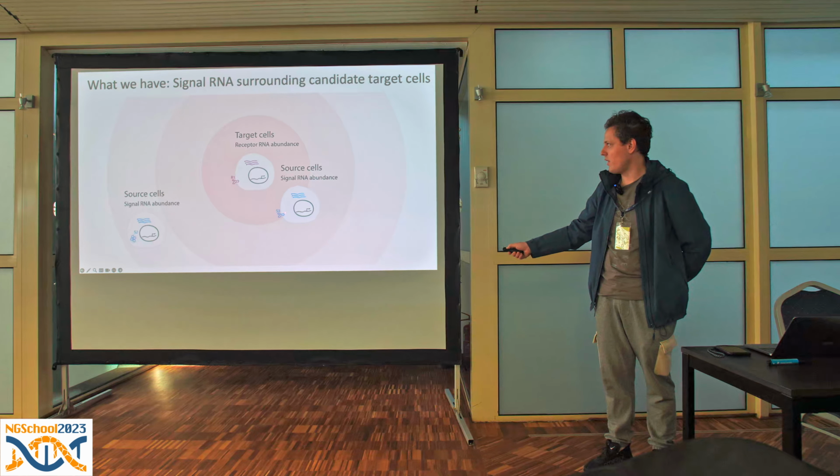One of the main questions is that you don't really know what the consequence of that interaction is. You don't know what happened in response to that interaction. You just see colocalization, so there are a lot of entangled phenotypes. What you need is basically to film, to have a movie during some time after you target the cell, and then see how RNA expression changes over time. Or not just RNA expression.